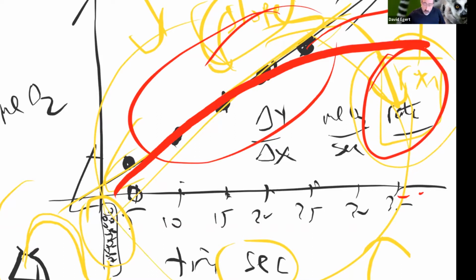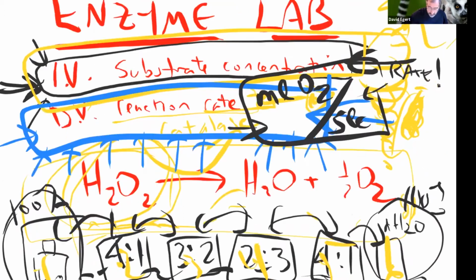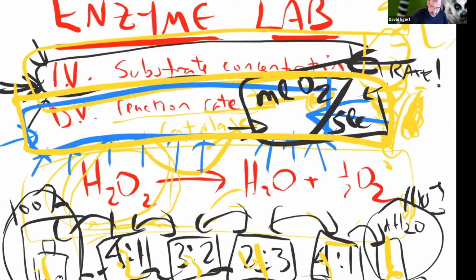And what part of it is actually the part I care about? So we'll talk about this in more detail later. But just putting that out there as we begin, the dependent variable, the reaction rate, is something that you are going to have to calculate after you've graphed the trial and looked at oxygen versus time and found the slope and all that.